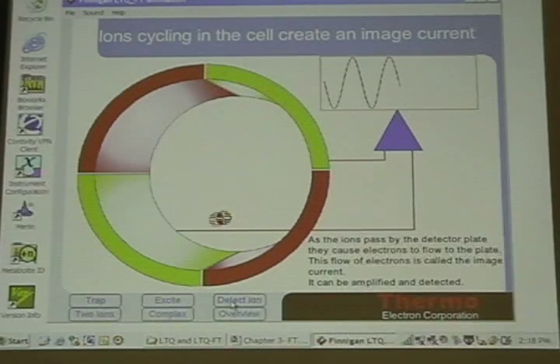We can't control space charge actively. This would be our ultimate goal: to somehow look at what's eluting and adjust the population to give you the best dynamic range without space charge. Can't do that. It's a fixed concept. You always tell us how many ions in the cell you want. AGC regulates to give it in your FT just like it does in the LTQ. If you have a complex mixture eluting and you're at a high population, you're going to get space charge, and you're not going to get the low mass error you're looking for.